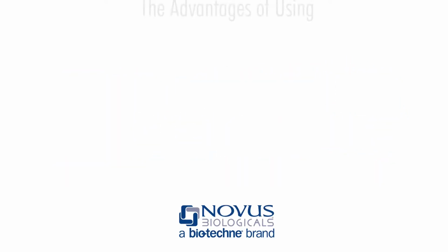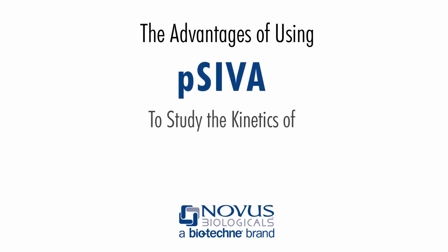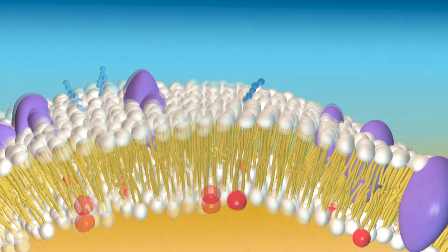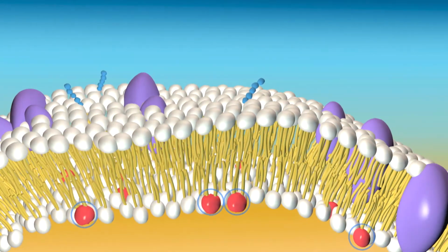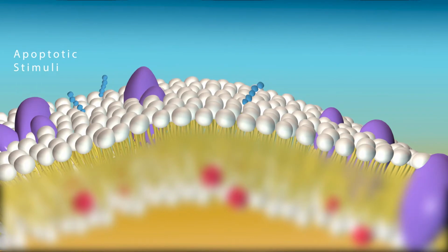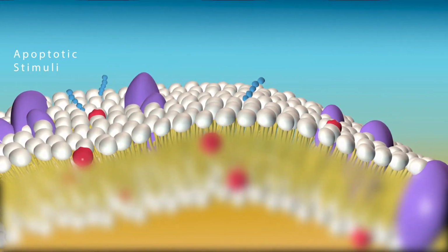In this video, we will discuss the advantages of using pSIVA to study the kinetics of phosphatidylserine externalization during apoptosis. The distribution of phospholipids in normal eukaryotic cells is asymmetrical, and phosphatidylserine primarily resides in the inner leaflet of the plasma membrane. During the early stages of apoptosis, phosphatidylserine flips from the inner to the outer bilayer.